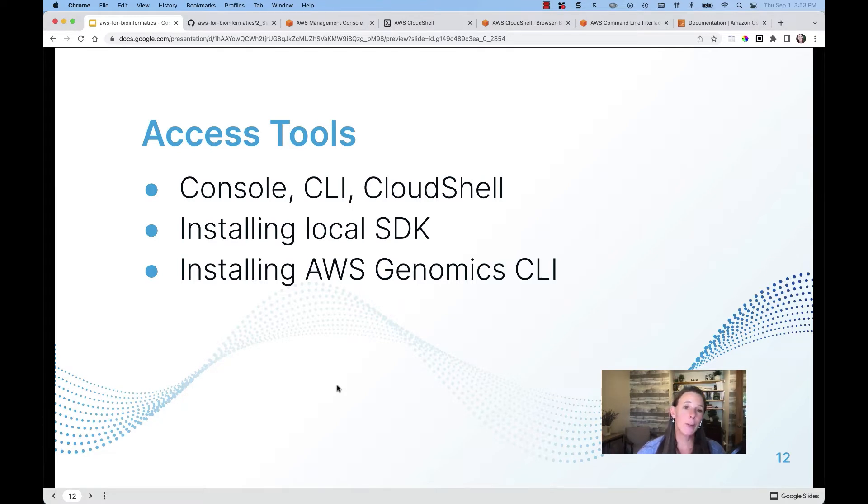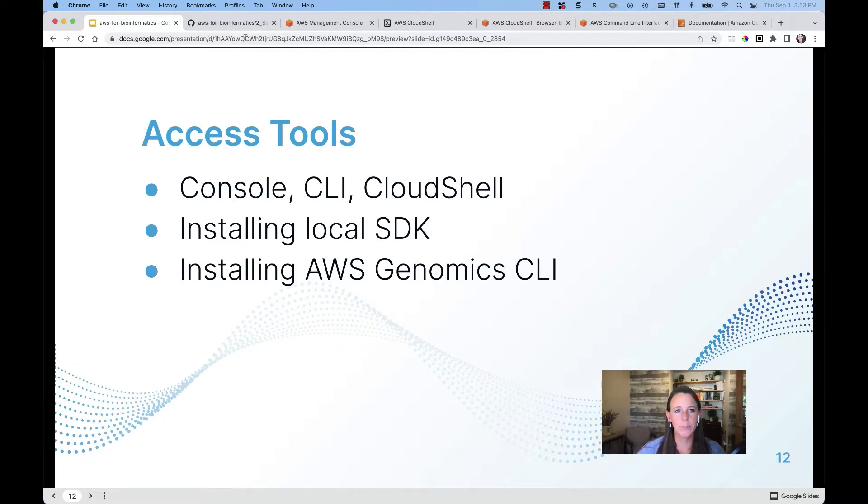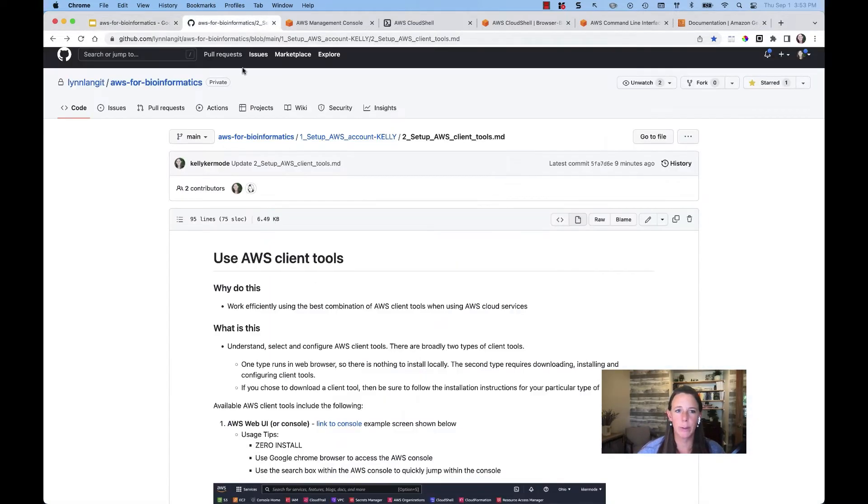I'll be introducing the AWS Genomics CLI, but we are going to be working with that more in detail later in this course. So let's head over to our repo.